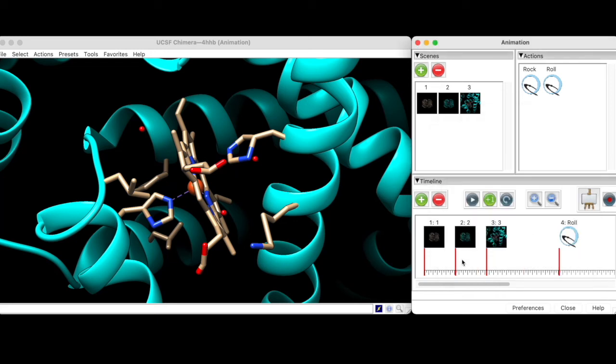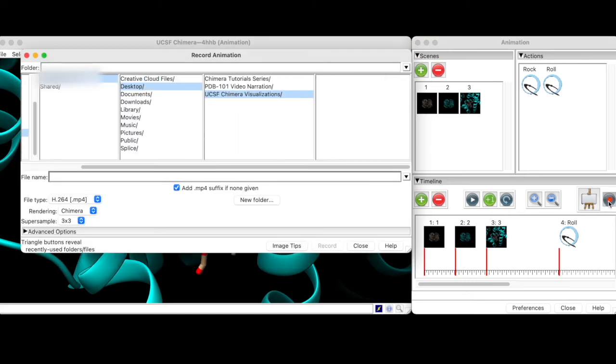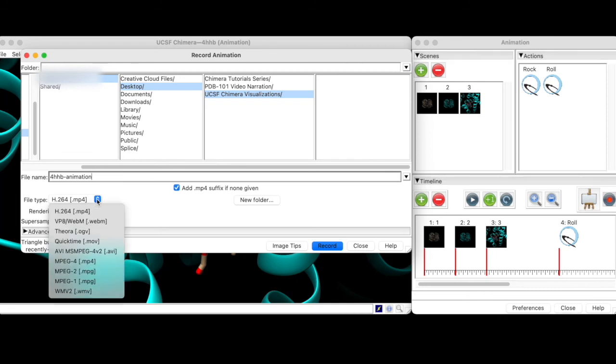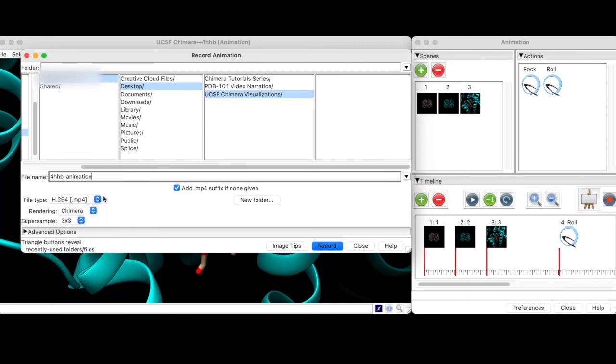Now we are ready to export the animation. To do this, we click the red and grey record button. We can give our animation a suitable name such as 4hhb-animation. Next we need to select the file format. Here I'll go with the default h.264.mp4. Finally, we hit record and wait for the animation to render.